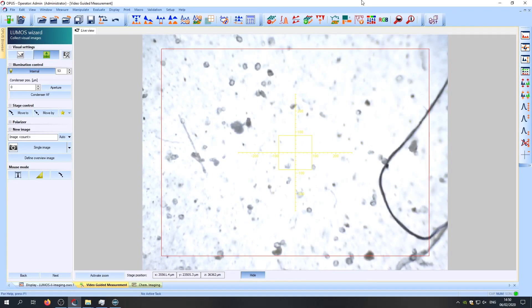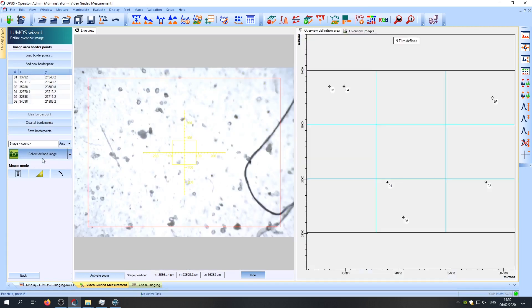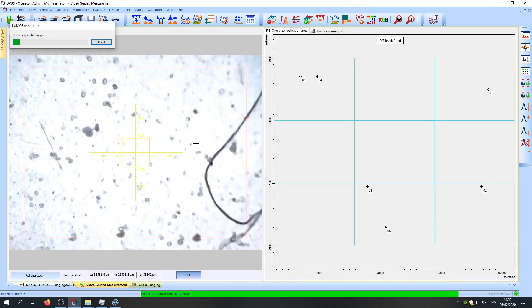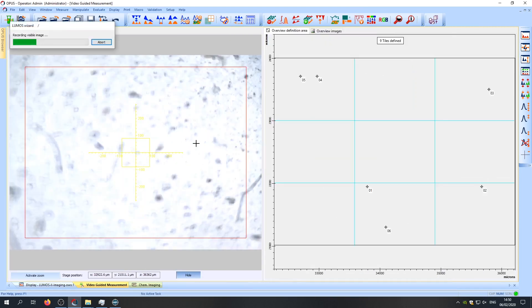To show you the benefit of FTIR mapping, I will collect an overview image of a part of the sample, but you could, of course, also collect an overview image of the whole filter.